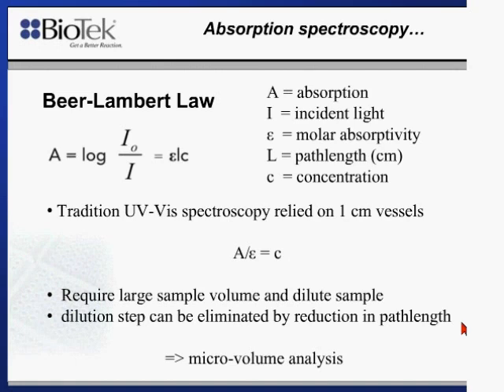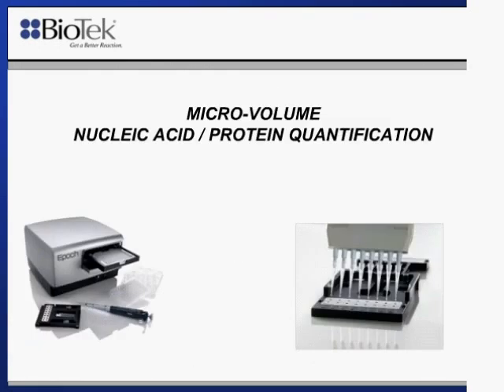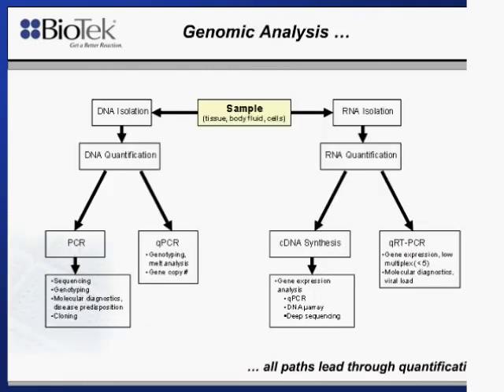So I'd like to introduce you to microvolume analysis here at BioTek using our instrumentation, as well as discuss some other instrumentation. So if we think about the typical workflows that apparently most folks are using based on the poll question, we start with some sort of sample here, and this can be tissue, body fluids, or cell culture, which I'm sure most folks are using as well.